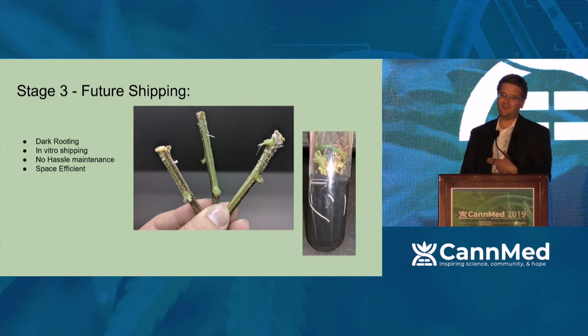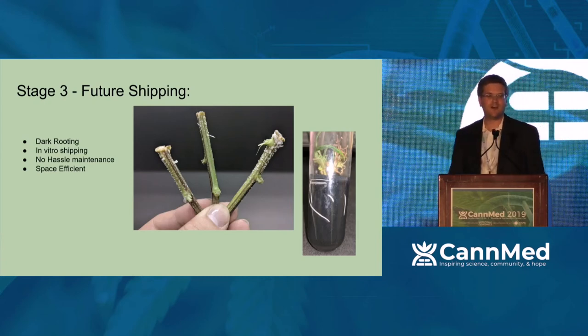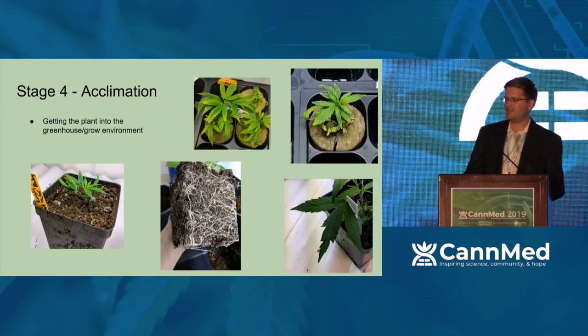Some go completely straight out, and I don't know what causes that. I didn't look enough into it, just throwing that out as food for thought. Not necessarily perfect root systems. Stage four, the acclimation stage.